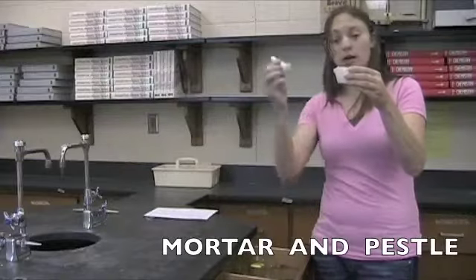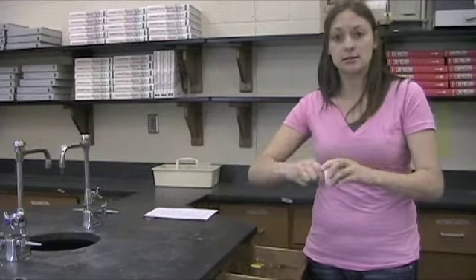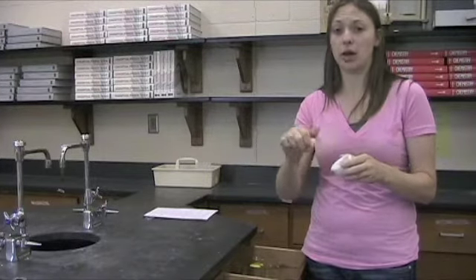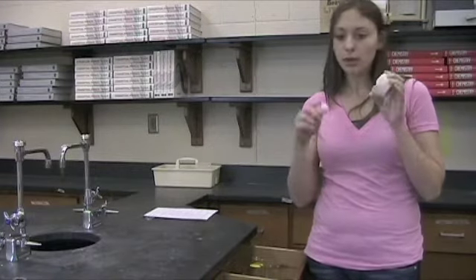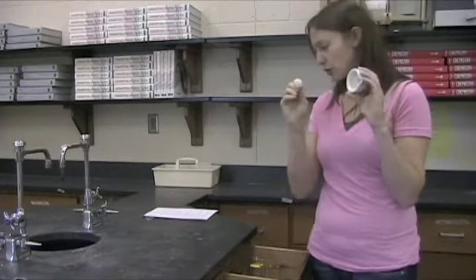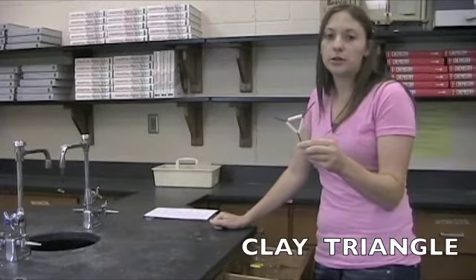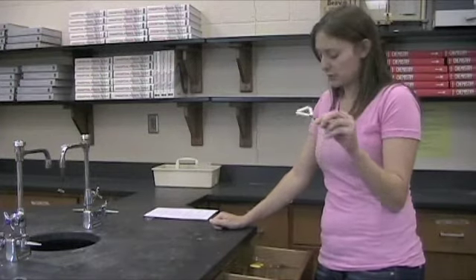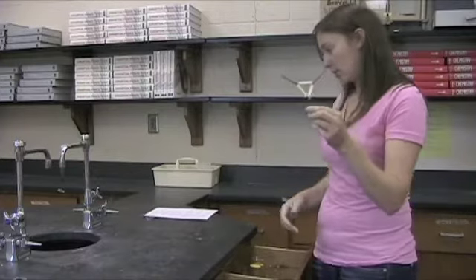I have a mortar and pestle. They are used to grind. So, if I had a substance that's in big chunks and I want to kind of crush it and grind it up so I can put it in my beaker or whatever, that's what these are used for. Crush and grind. We have a clay triangle. Clay triangles are used over Bunsen burners. They will hold crucibles. The crucible sits right in the middle there and you can heat the crucible.